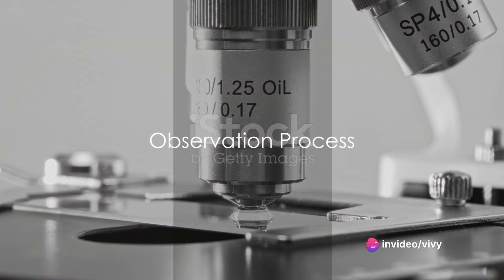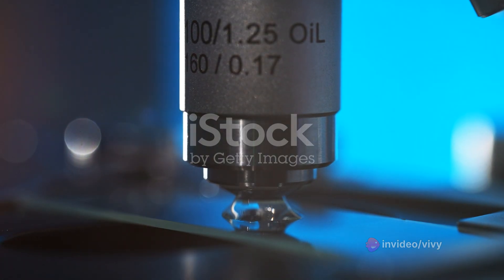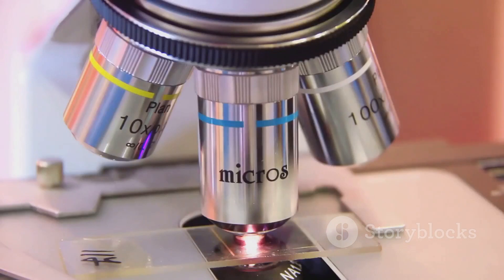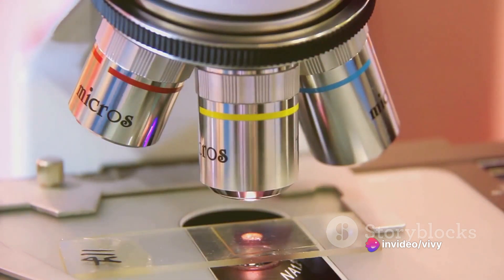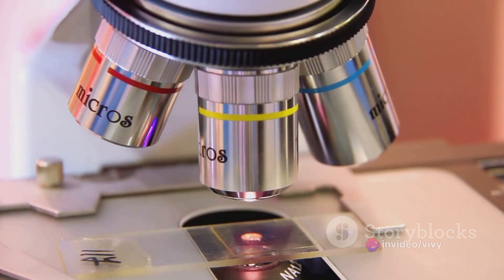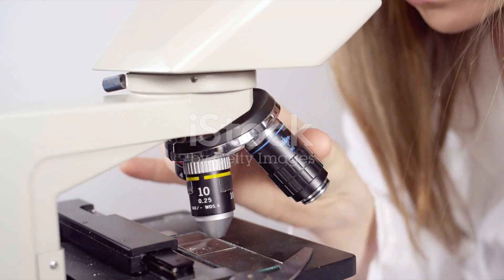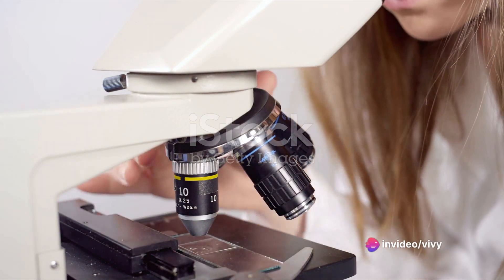Now, the prepared slide is ready to be observed under the microscope. Place the slide on the microscope's stage, securing it with the stage clips. Start with the microscope's lowest power objective lens and the coarse focus knob for initial viewing. Look through the eyepiece and slowly adjust the coarse focus knob until the image comes into focus. Once in focus at the lowest power, switch to the higher power lenses and utilize the fine focus knob for clearer, detailed viewing.